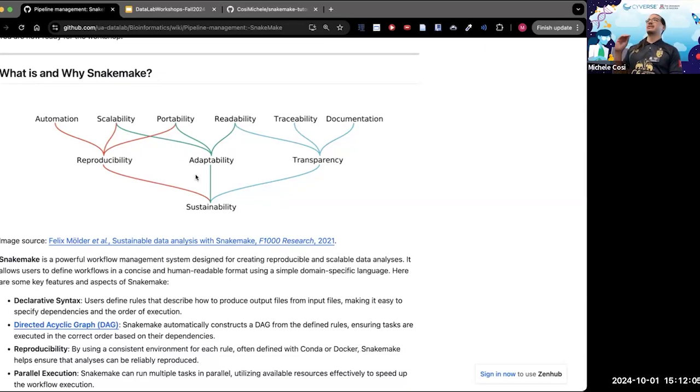Snakemake can allow you to also run R. It is something that they have made sure is integratable. However, the syntax will have to be in the syntax of the snake file, the file where you run your Snakemake workflow, which is going to be in Python with an R file that you call later. I'm going to show you what I mean in a second.